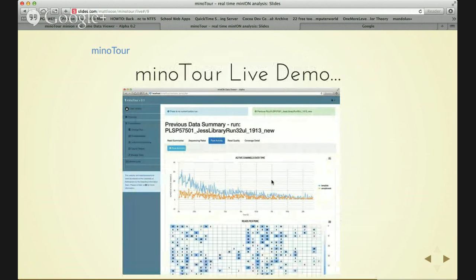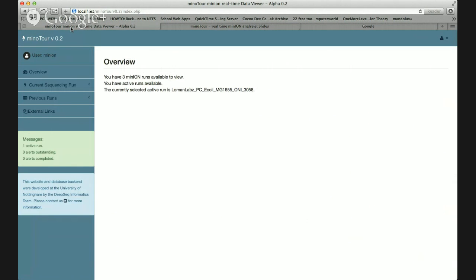I'm showing some runs that are early runs. They're R6 runs. They're before we knew what we were doing, perhaps at times. We've made some mistakes. We're getting better, and I was hoping to show you the R7 data, and I'll explain a little bit later why we can't do that. So hopefully you can now see a view of our very basic web interface.